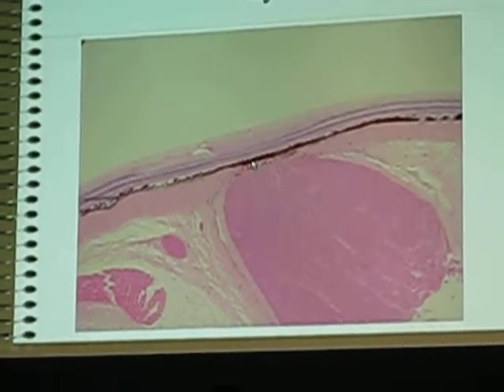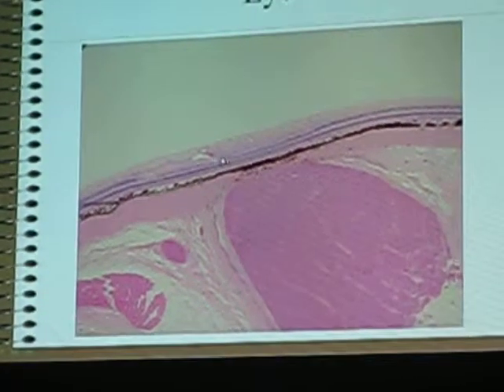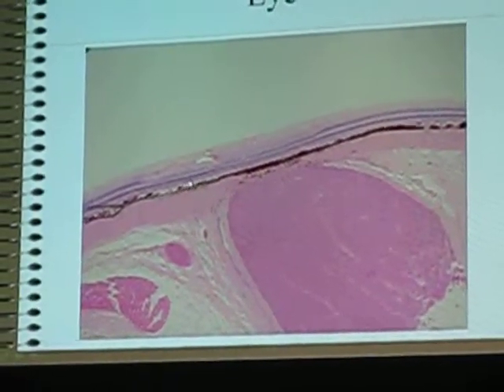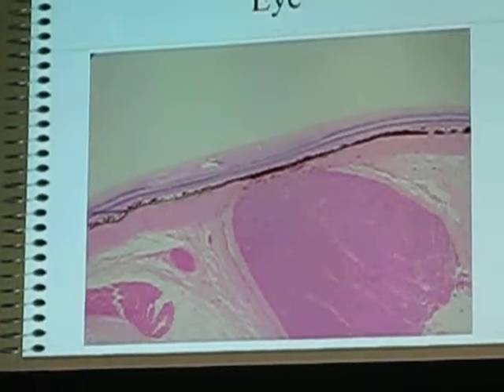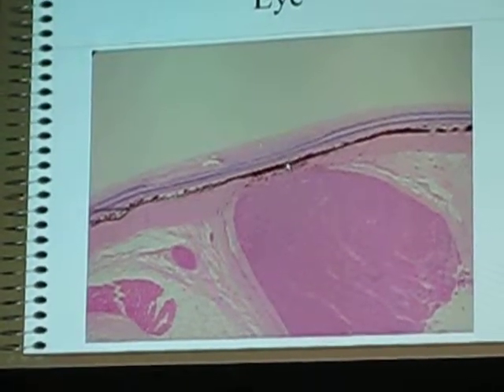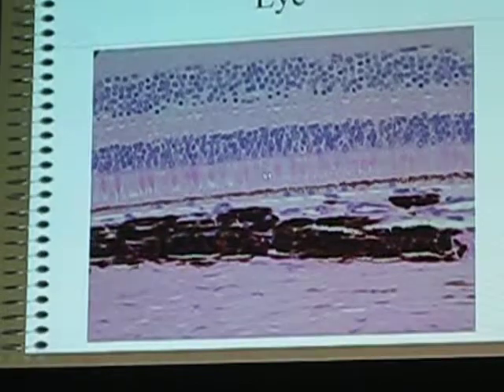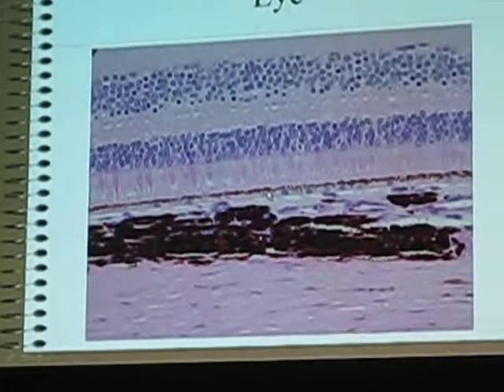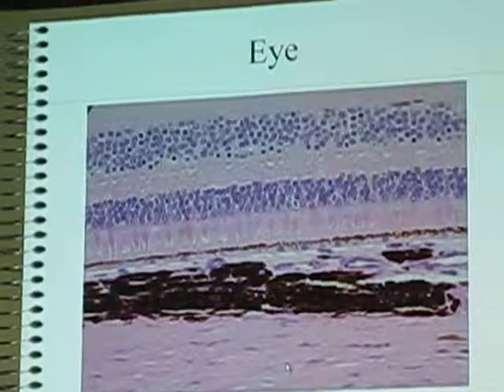Vitreous chamber. Here's all those bipolar and ganglionic neurons of the retina that you don't have to know. Rods and cones certainly can't pick those out. The pigmented layer of the retina you can't pick out on low power, but you can definitely see the choroid, which has a lot of melanin. You can definitely see the sclera and the rectus muscles. Up close, rods and cones, pigmented layer of the retina, choroid, sclera.